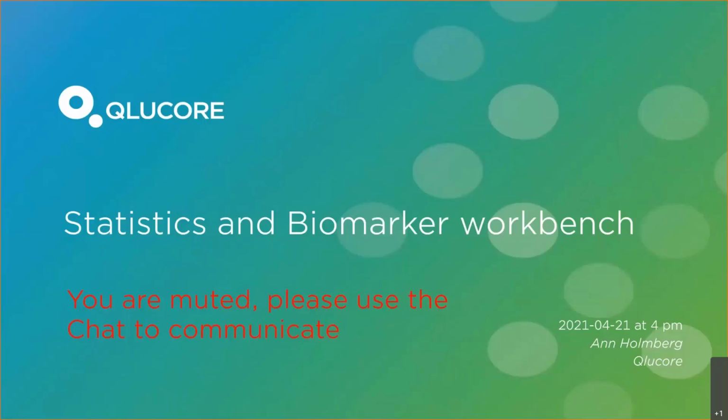Welcome to this webinar. I'm Ann Holmberg from Qlucore, and I will talk to you today about statistics, both new and existing, as well as the new Biomarker Workbench. So I hope it will be quite exciting. So let's get started.